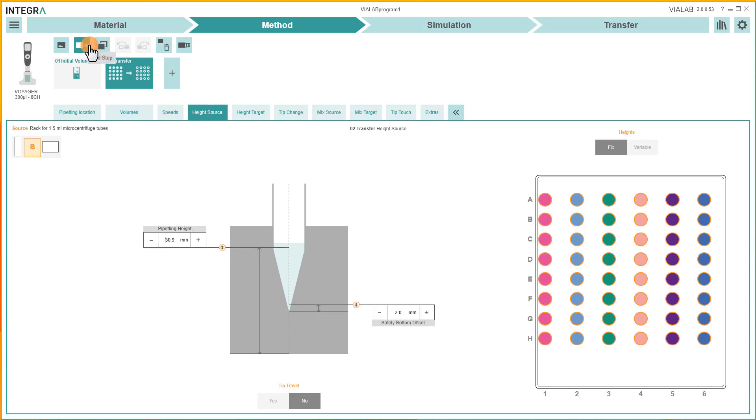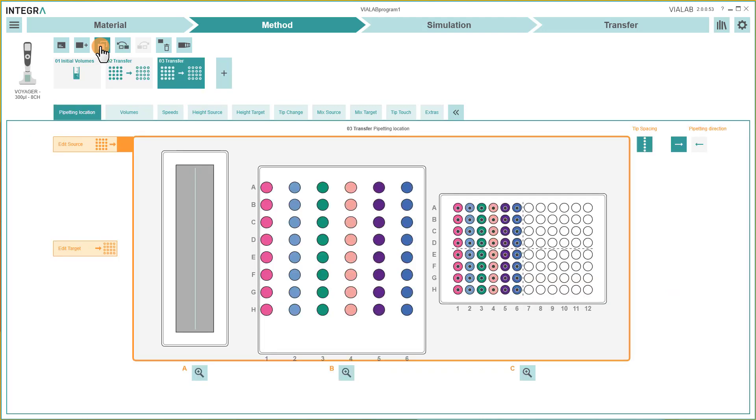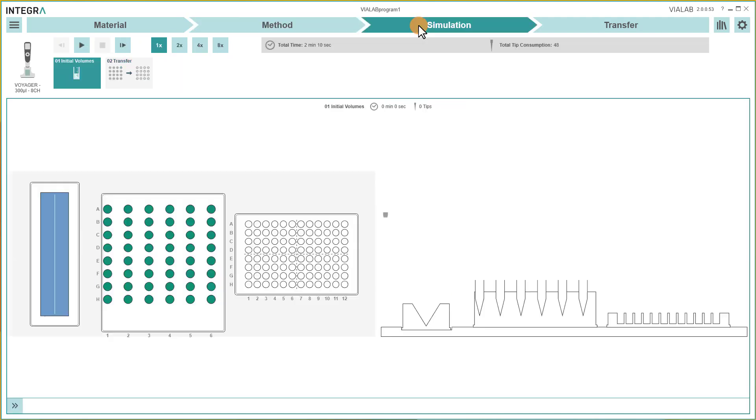Steps can be copied, deleted, or simply moved. By switching to Simulation, you can have a detailed look at your program running.